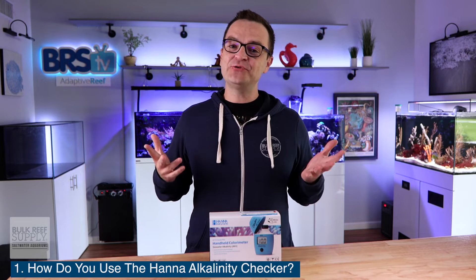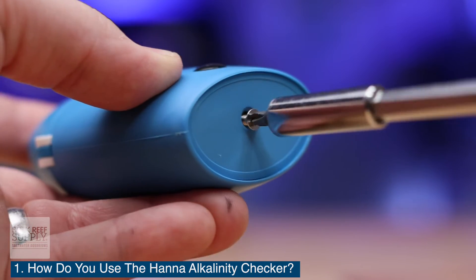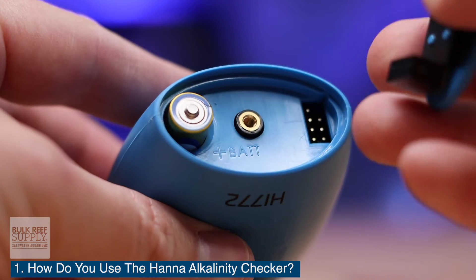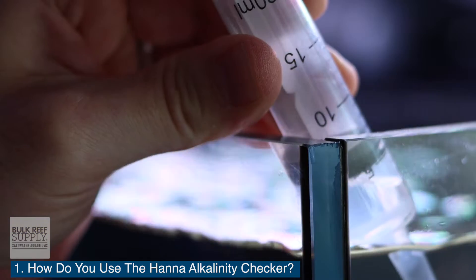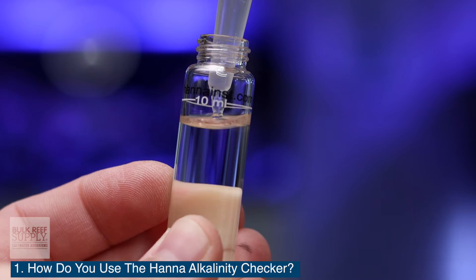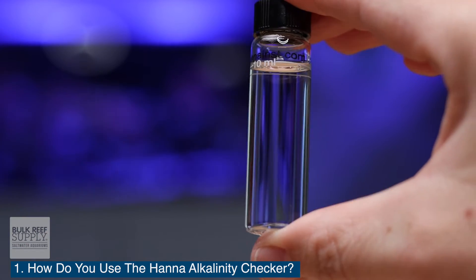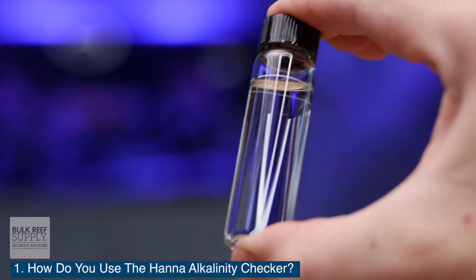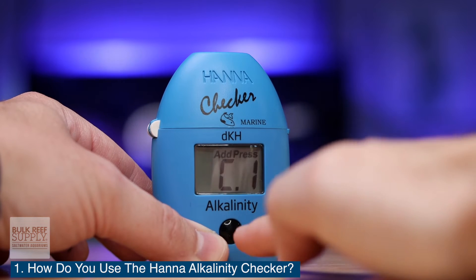Question number one: how do you use the Hanna Alkalinity Checker? Use a Phillips head screwdriver to remove the battery cover and install the included battery. Replace the cover and tighten the screw. Press the on-off button to power the checker on. Fill a cuvette with 10 milliliters of sample water and screw the top back on. Hold the cuvette by the top and bottom and wipe any blemishes or liquid off the sides with a soft cloth. Place the cuvette into the checker and firmly close the lid.